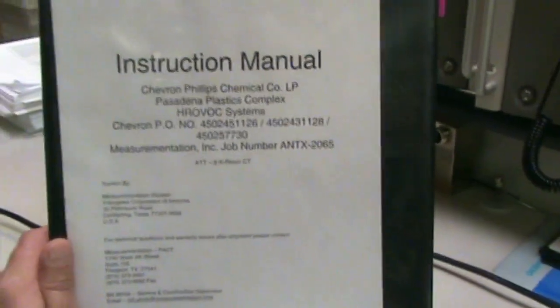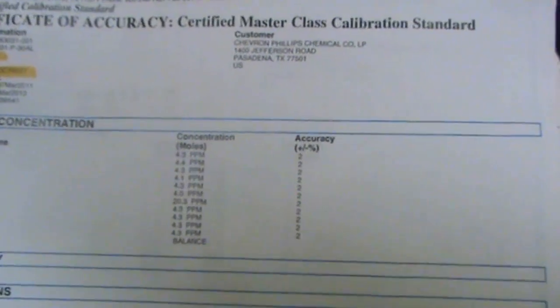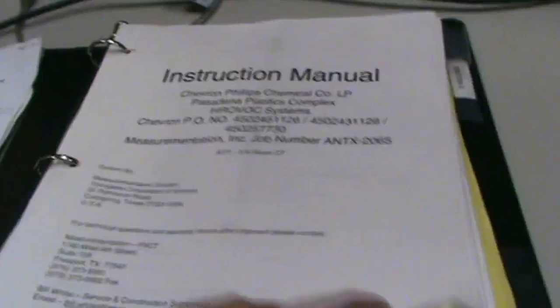Oh, while we're waiting, let's see here. So each analyzer should have come with a book like this from, they build these over in Cold Springs, Texas. So we're going to open this guy up. This is what they calibrated it with before. And ours, I believe, is all 10s except for methane, and that's going to be like an 80 ppm. Alright. I don't want to have to say what HRVOC stands for. Y'all should already know that.